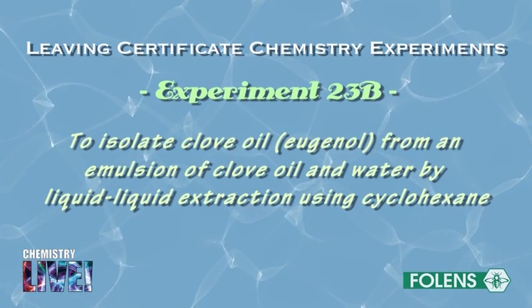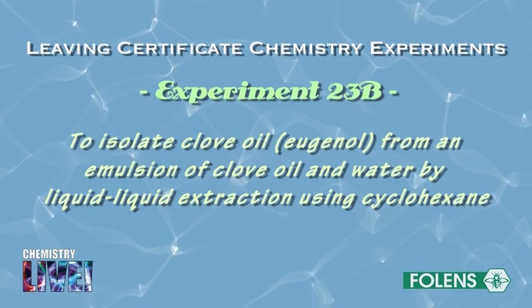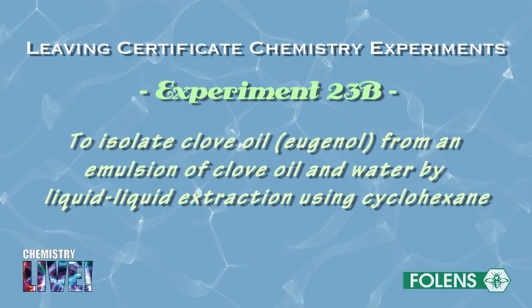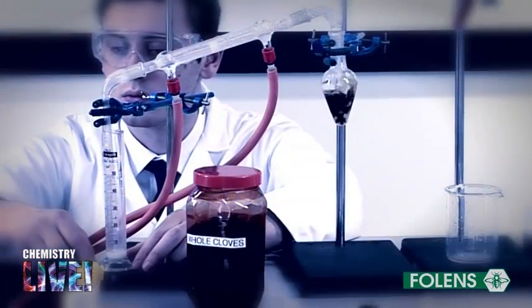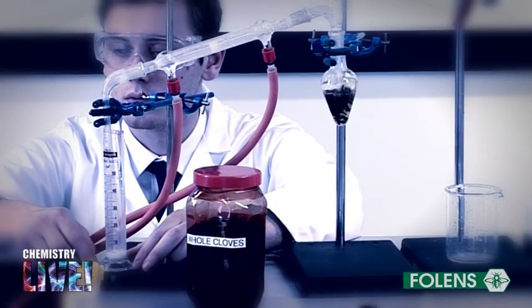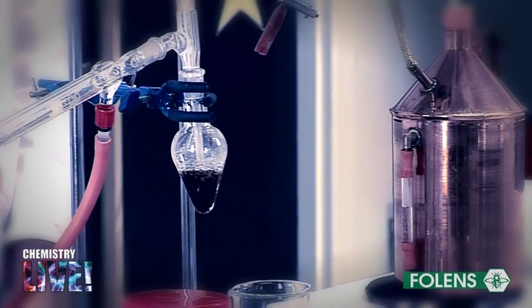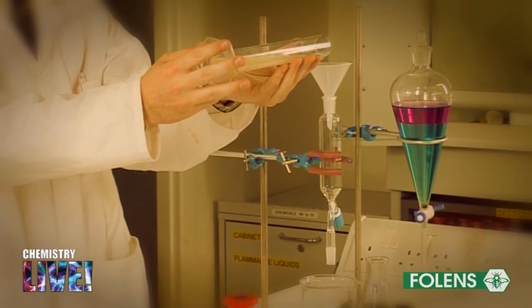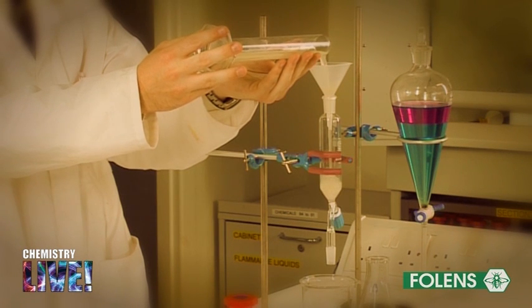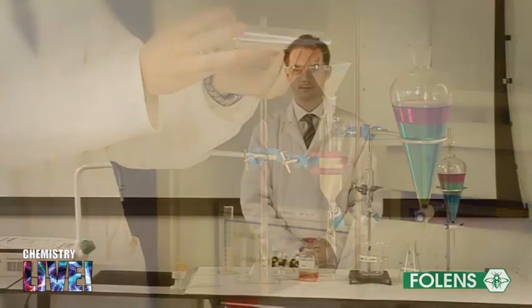To isolate clove oil, eugenol, from an emulsion of clove oil and water by liquid-liquid extraction using cyclohexane. In the previous experiment, we saw how steam distillation was used to obtain an emulsion consisting of a mixture of clove oil and water from cloves. In the second part of this experiment, we will extract the clove oil from the emulsion using a technique called liquid-liquid extraction or solvent extraction.